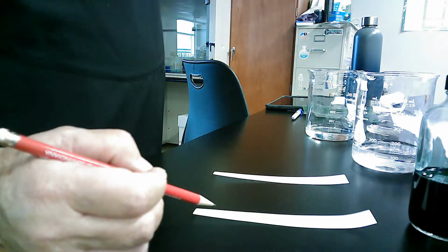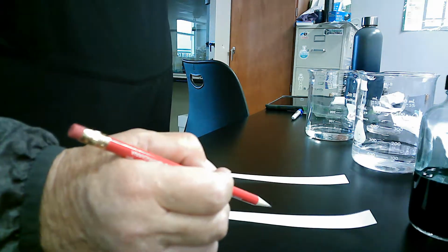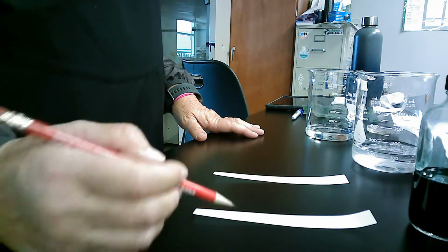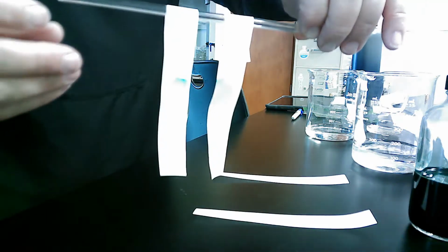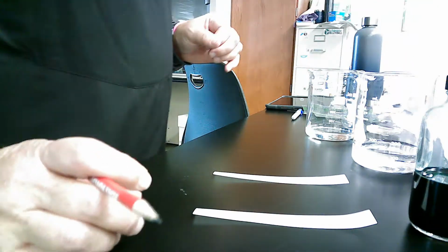Once I get the chromatogram, then I'll be able to do some measurements. They're called the Rf factors, to be able to compare the movement. And then I can use that to identify any other substances, maybe an unknown substance. So this is what our chromatograms are going to look like. This is one of them, one that I did earlier. When we get done, this is what another one looks like that I did earlier. So those are what we're going to be doing.